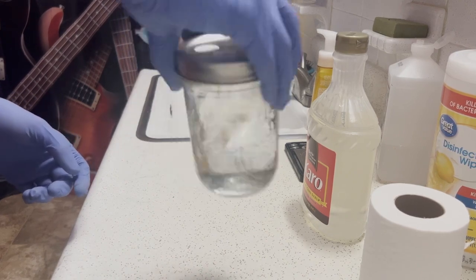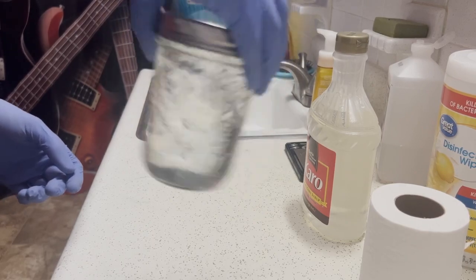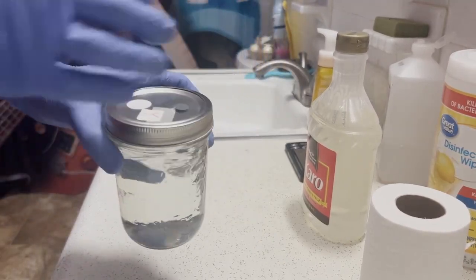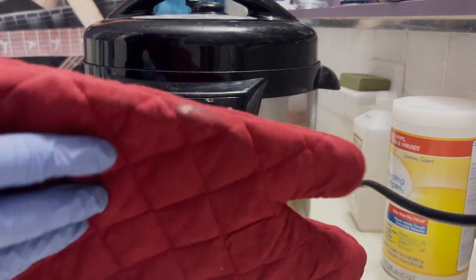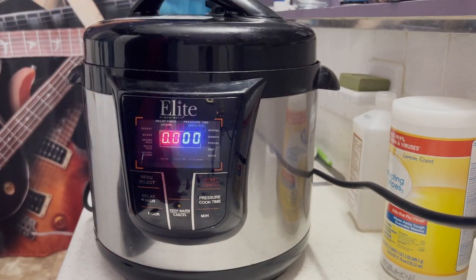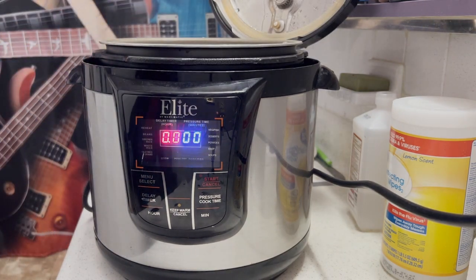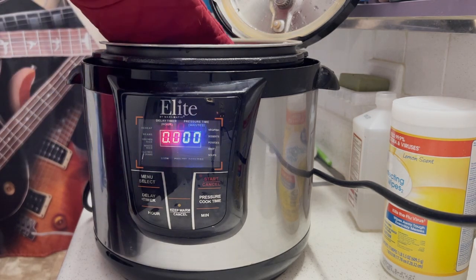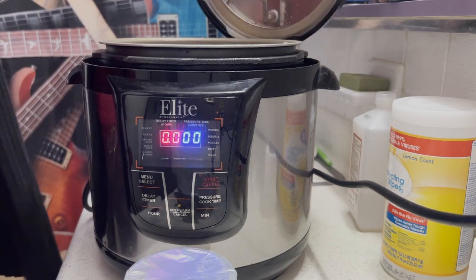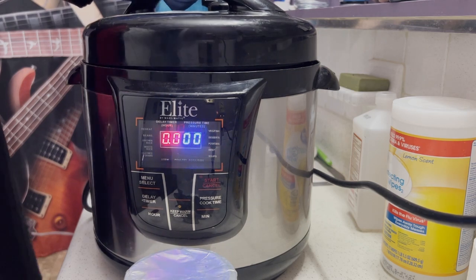The next step is to pressure sterilize this at 15 psi for 90 minutes. I made sure to put tinfoil over the top of the jar to make sure that water doesn't get inside it. Most pressure cookers operate at pretty much the same temperature, so you can set it to 90 minutes and you're good. This is after I've fully pressure sterilized the jar — you can see the tinfoil. The tinfoil protects against steam going in there and filling up the jar more than we want.